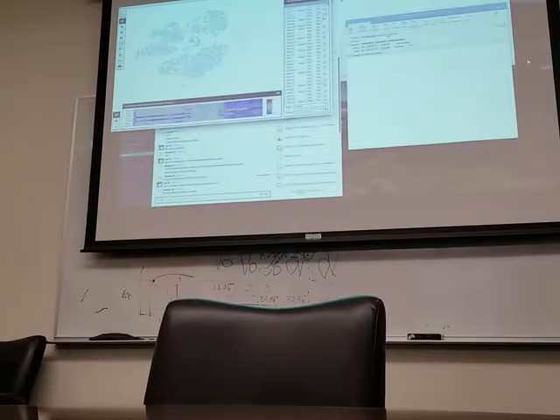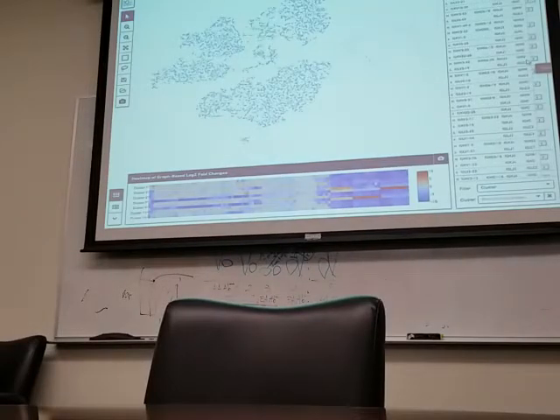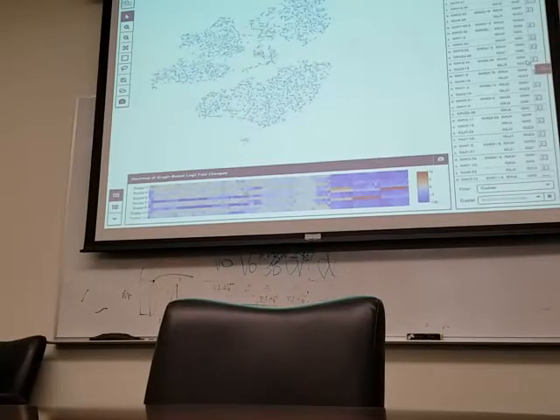But we're dealing with very specific cell populations, either memory B cells or plasmablasts. And so the question was, can you identify large lineages with just 400 cells? So what we did was, we have some preliminary data for bulk RepSeq, and we have tens of thousands or hundreds of thousands of sequences, and we've identified the clonality plots for those.